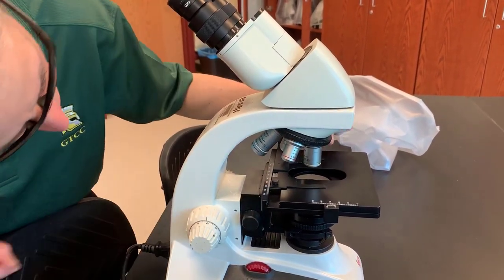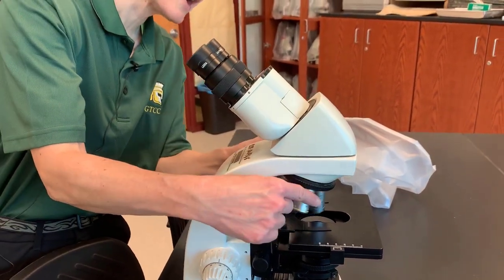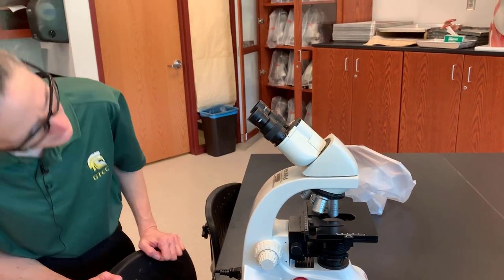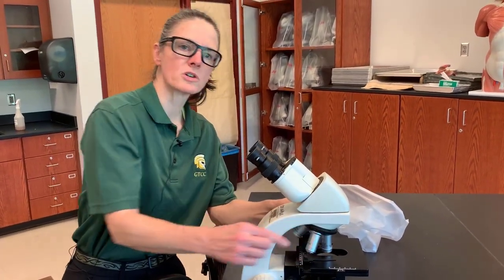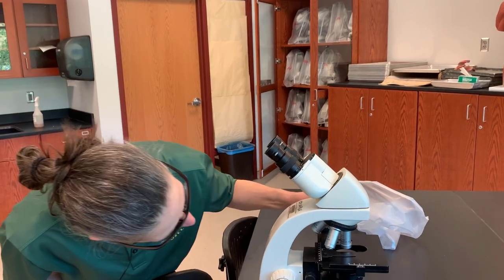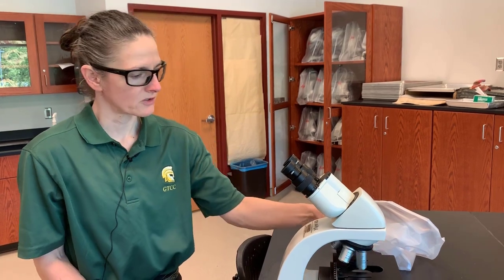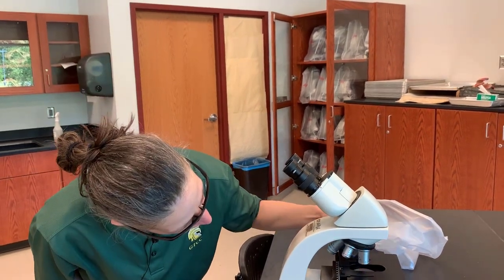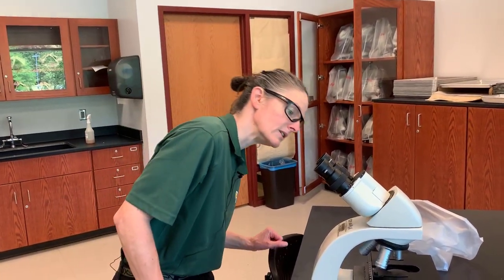The next highest is called the low-powered lens, and the next highest is called the high-powered lens. The highest power we have, we will not be using in this class. It actually requires a drop of oil between it and the specimen to prevent distortion, because light moving through the slide will be distorted without the aid of an oil drop between the lens and the slide.